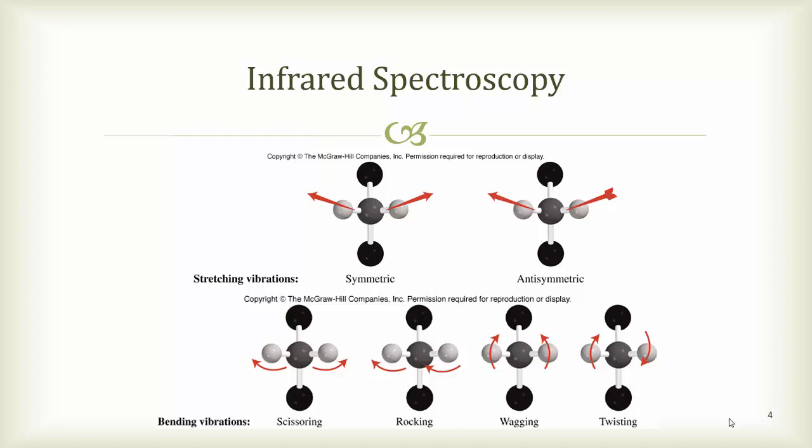When a beam of IR light is directed at a sample, some of the photons are absorbed by the molecule as the molecule undergoes a specific vibrational movement. The remaining photons pass through the molecule and strike a detector. The detector sends a signal to the computer, which interprets the data and generates a spectrum. The spectrum is a graphical representation showing which photons were absorbed or transmitted, those that were not absorbed, by the compound. Because different functional groups create distinct absorption bands, the spectrum can be interpreted to determine the functional group composition of the compound.